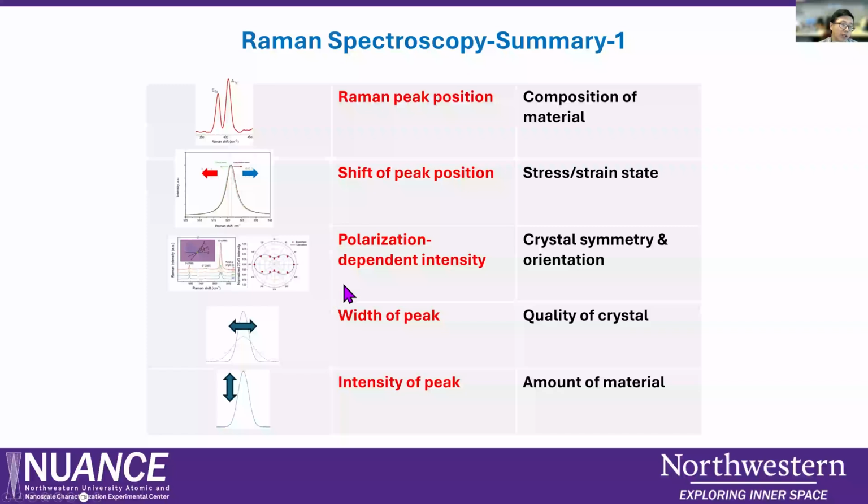And if you change the polarization direction, which I didn't mention on the previous slide, our laser has a polarizer and we can use linear polarization and change the direction. If your Raman intensity changes, that gives you information about your crystal symmetry or orientation.